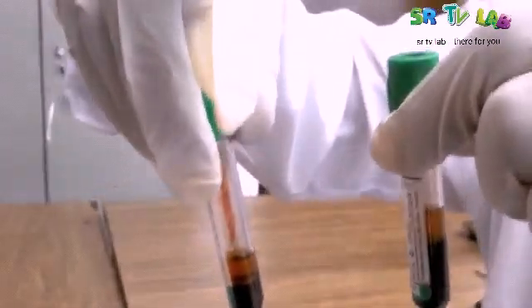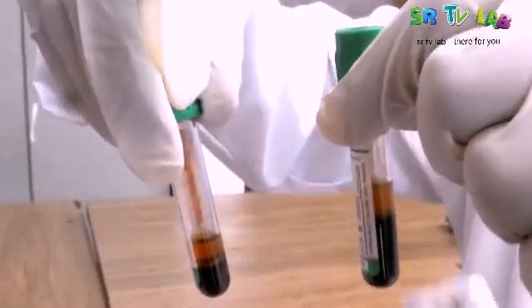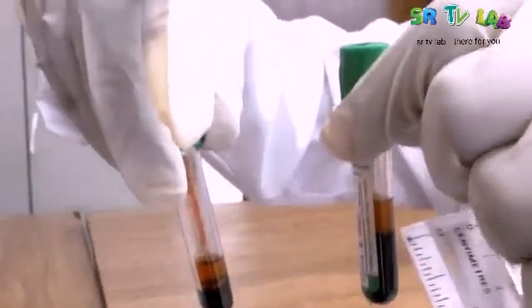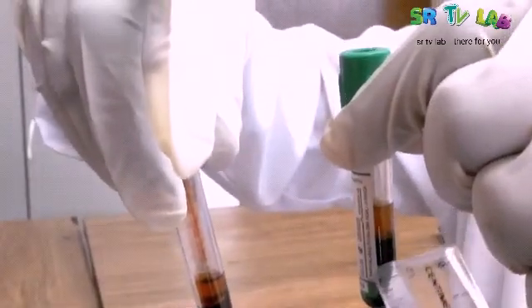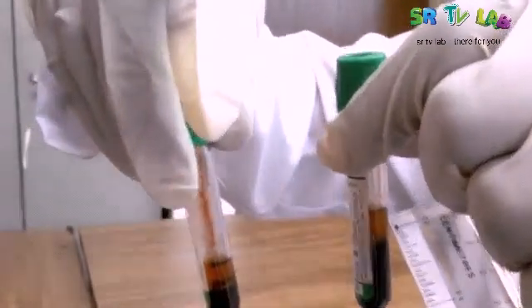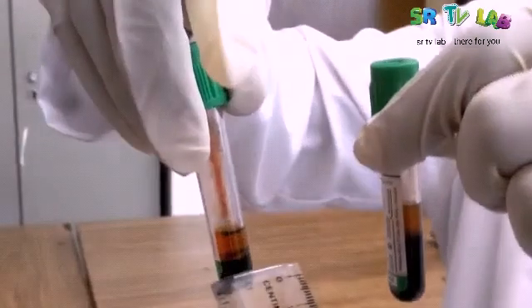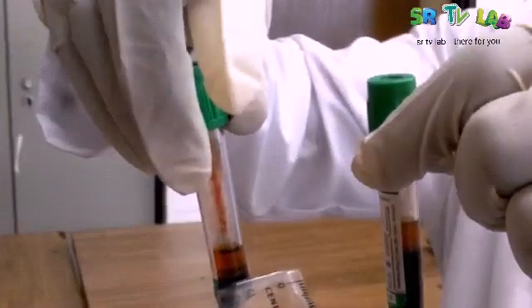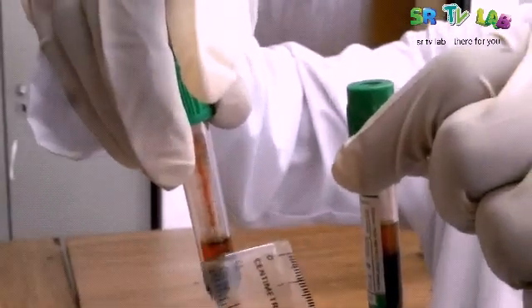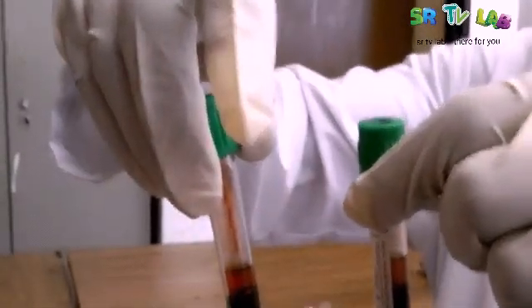Let's start with normal blood to see how normal blood looks like. You see we have two tubes here. The first one — the bottom part is very dense, that is concentrated red blood cells, and the upper part is brownish, that is plasma. Even in the other tube, the bottom part is concentrated red blood cells and the upper part is plasma. This is how normal blood looks like.